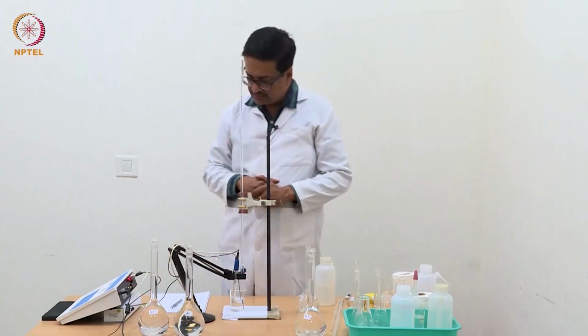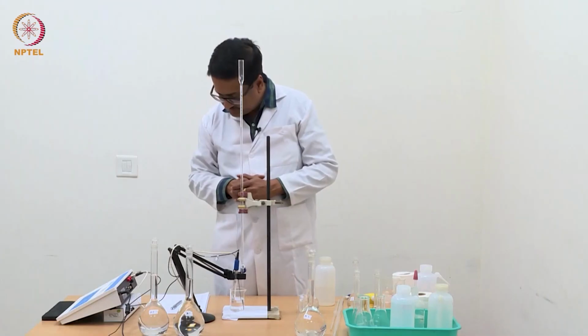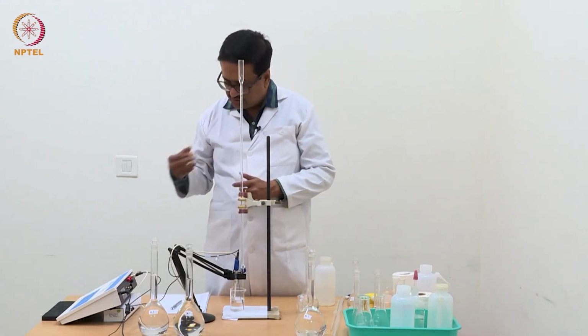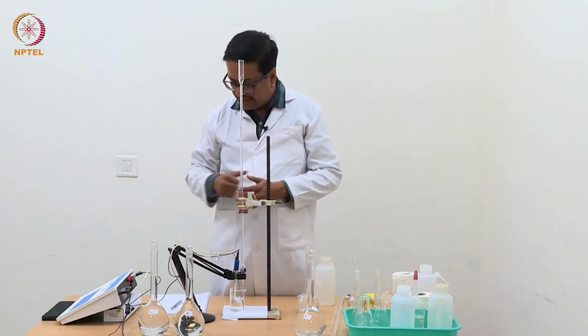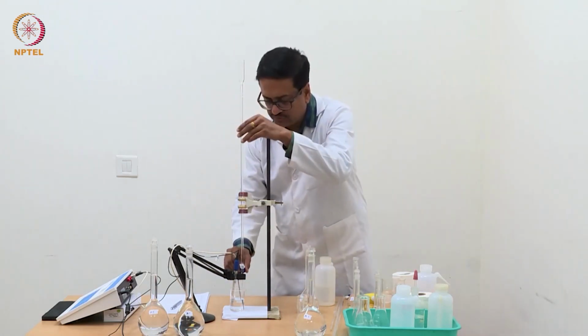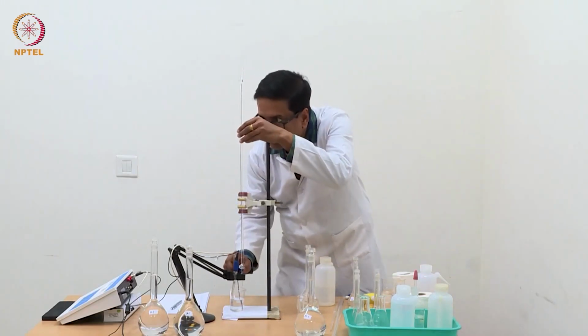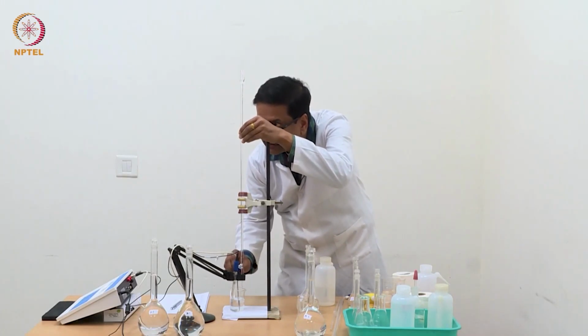So you have seen that the last two consecutive additions have increased the pH from 9.36 to 10.21 and now it is 10.32 and I have reached 1.56 ml. Maybe just two more readings will be enough for us to end this titration.